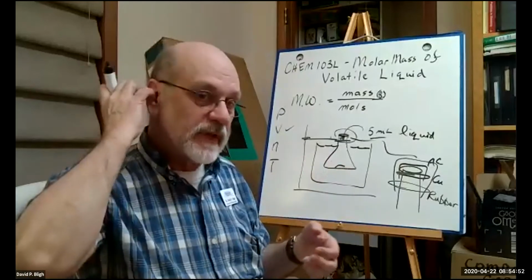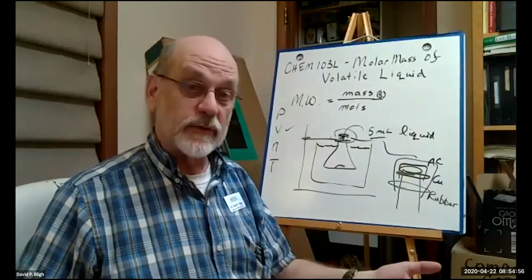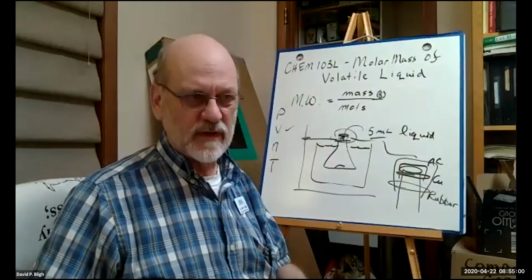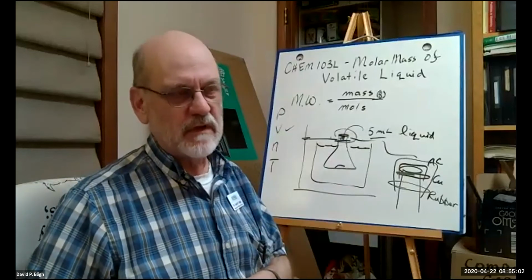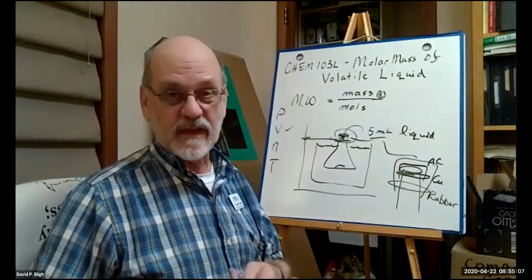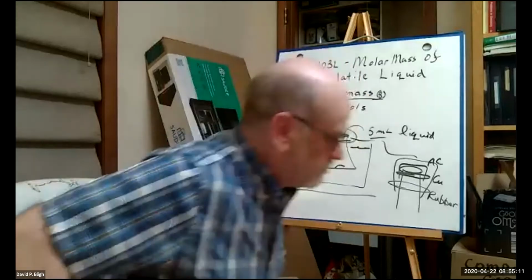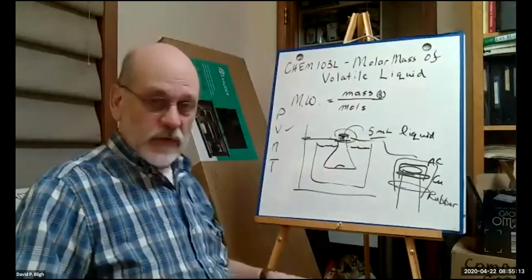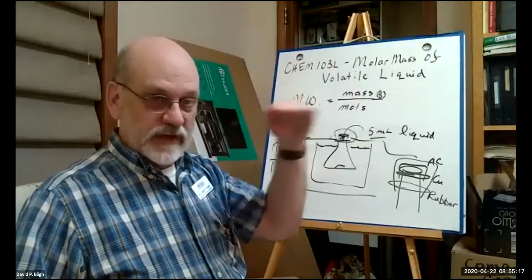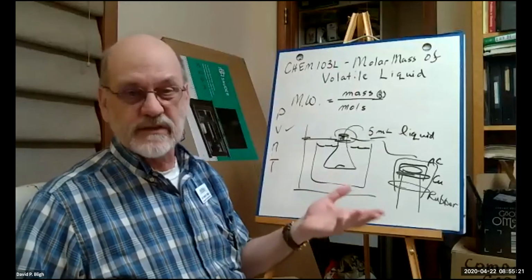So if the liquid has a boiling point of less than 100 degrees centigrade, considerably less, we probably wouldn't want to go much higher than 85 or 88 degrees. Anything above that wouldn't be volatile enough. So you'll notice in that table of the various liquids we choose from, I think the highest one is maybe 86 degrees.